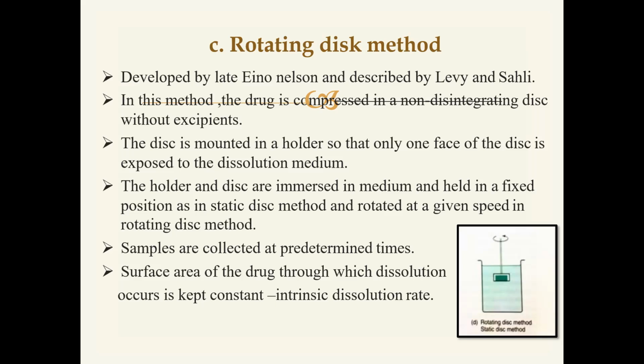Next, here we are maintaining some conditions. The holder is immersed to a depth of 1 inch in the dissolution medium, from this line to this line.